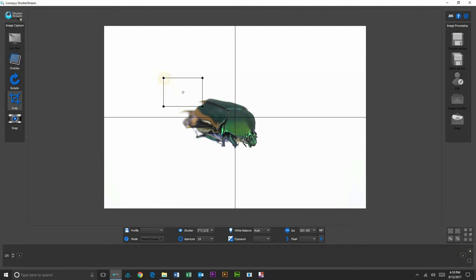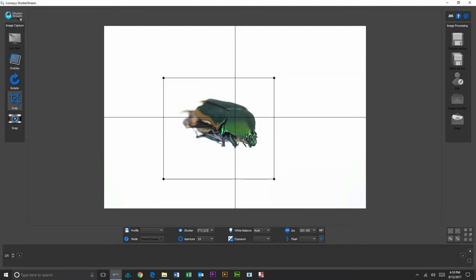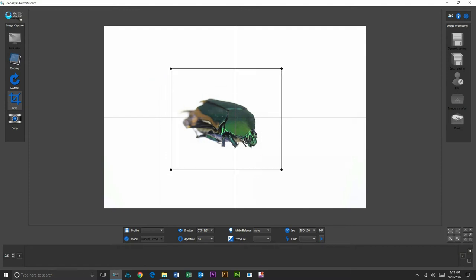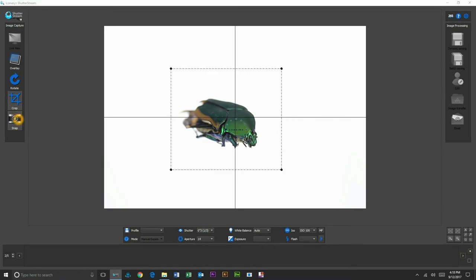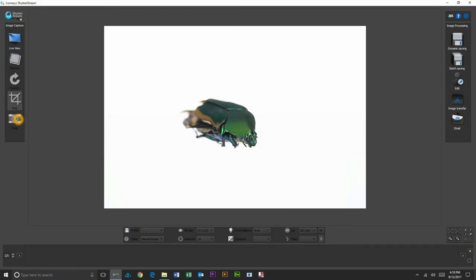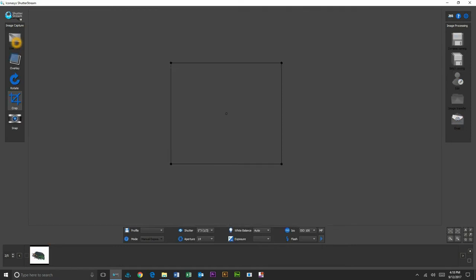We're going to pre-crop our subject and then we're going to hit our snap button. That's going to capture the image and upload it directly to our computer, and as we can see here, a very high-quality result captured in just seconds. So that's going to be our standard workflow: live view, adjust our object, and then we hit our snap button.